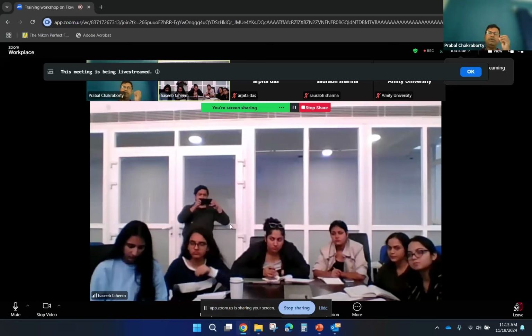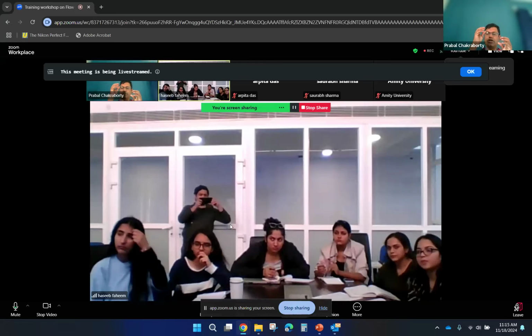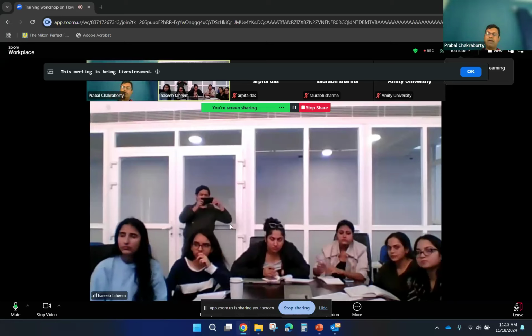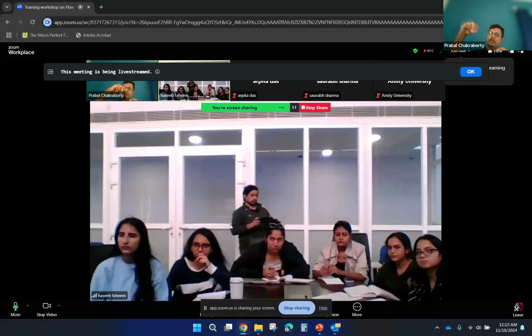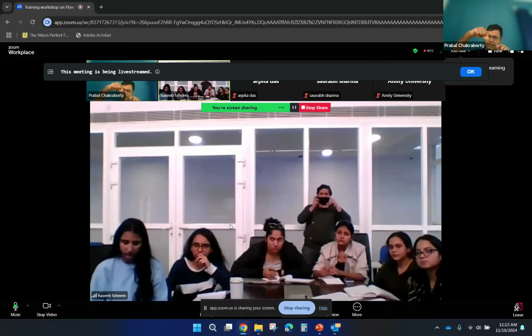Now if you tag that phalloidin with some fluorophore molecule, let's say green fluorescence, which is called FITC or Alexa Fluor 488, what will happen if you excite? Wherever you have the actin fibers that are already bound with this small molecule phalloidin, and with the phalloidin you have a fluorophore, from the excitation emission you can understand the location of the actin fibers.